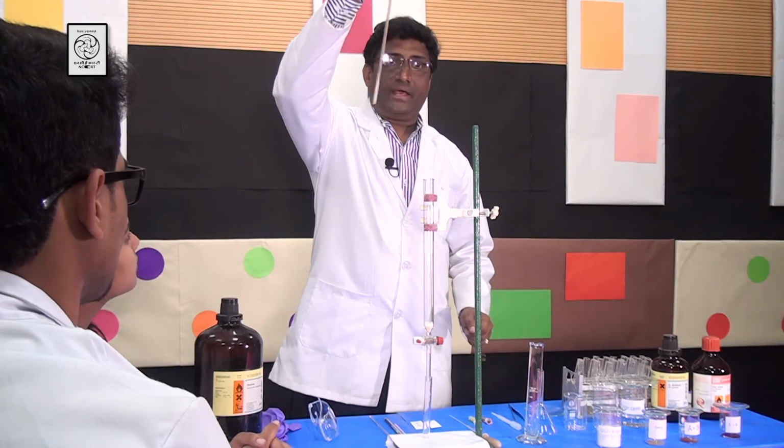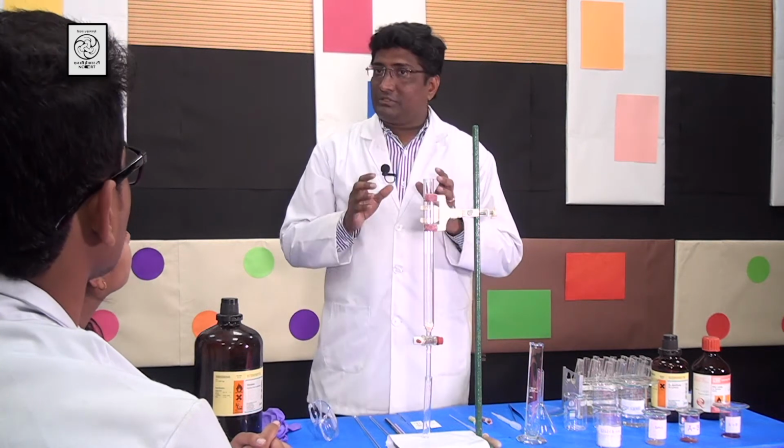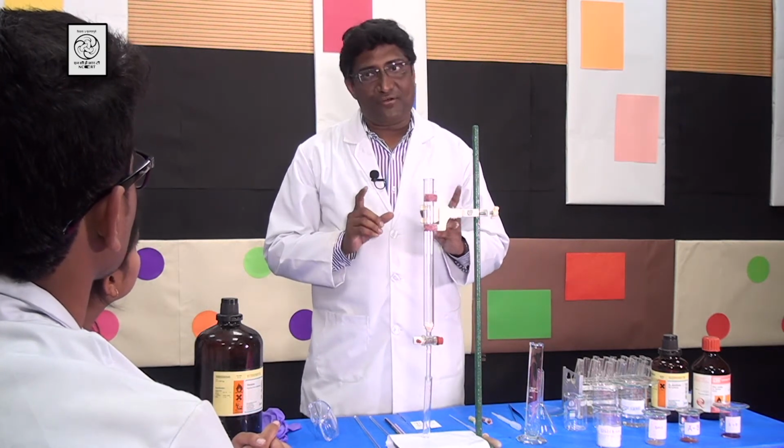So students, I have used the glass rod to press the cotton tightly. Now I am taking the glass rod and keeping it outside.